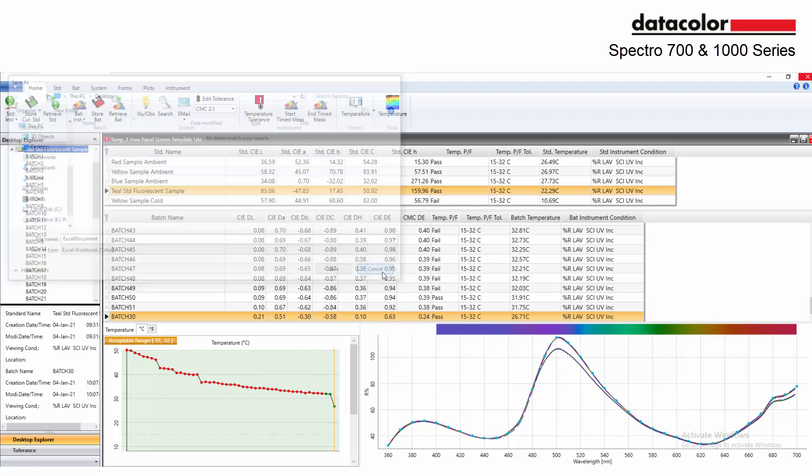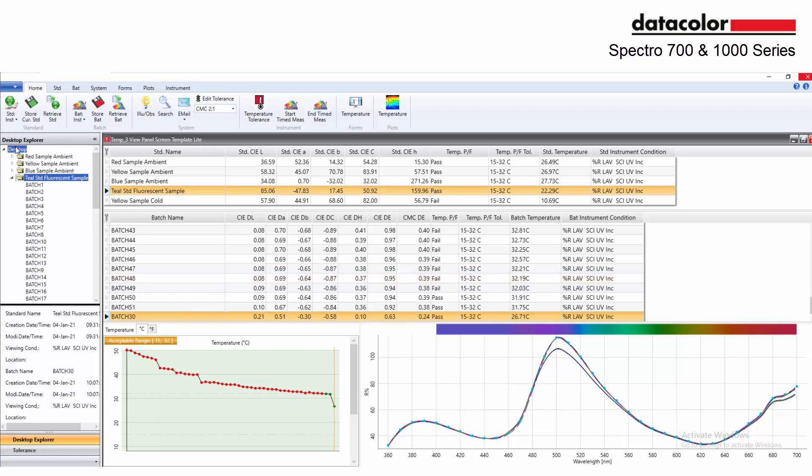The sample temperature can also be included in the QTX files and communicated to the supply chain as part of the digital color approval.